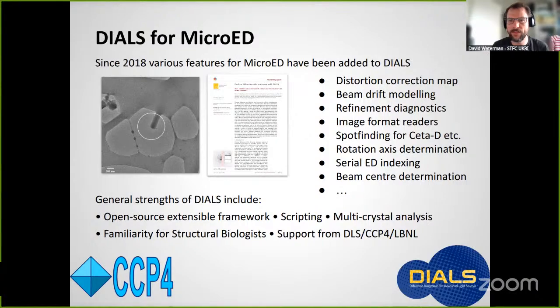Sometimes you have to work around some X-ray defaults. And there are some things that we lack, so we can't yet handle things like precession experiments, although we're looking into supporting that soon. And as I mentioned, the GUIs are not quite there yet. They're a bit weak in comparison with software like PETS and CrysAlisPro. And if you're an XDS user as well, you would notice that DIALS is not quite as fast as XDS.